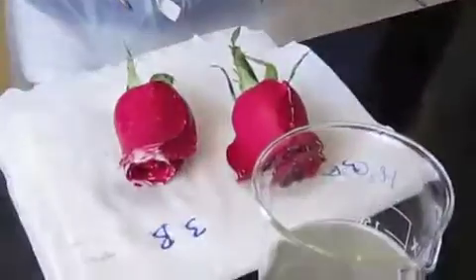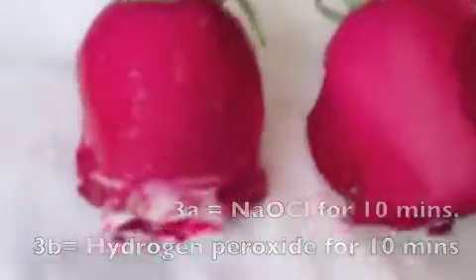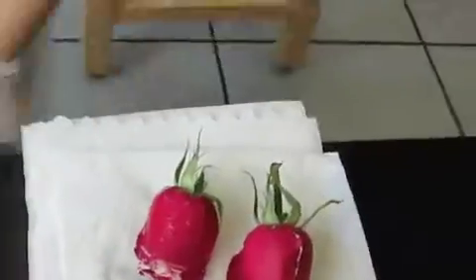That's the hydrogen peroxide. 4, 3. And that's the regular household chlorine bleach. Yeah, that's a bigger change. Oh wow, that's good. Yeah, I think overnight's a good idea. Where are the scissors? Okay.